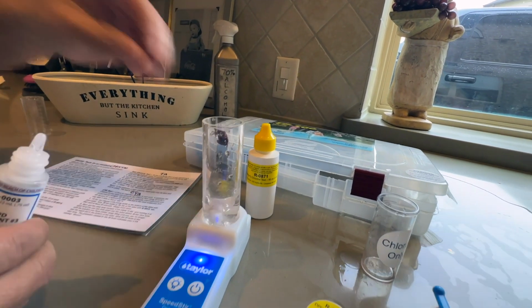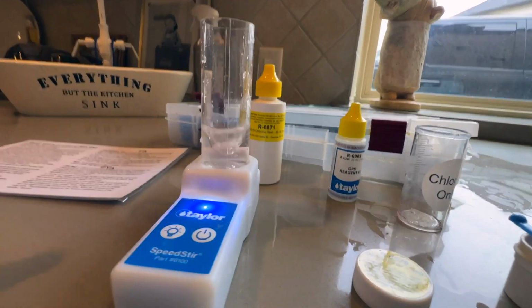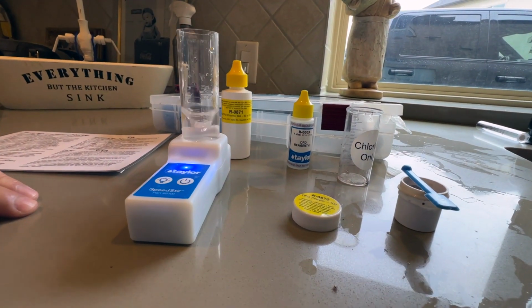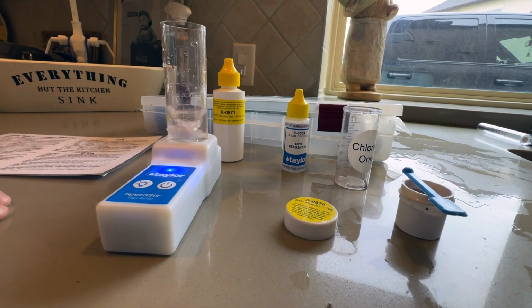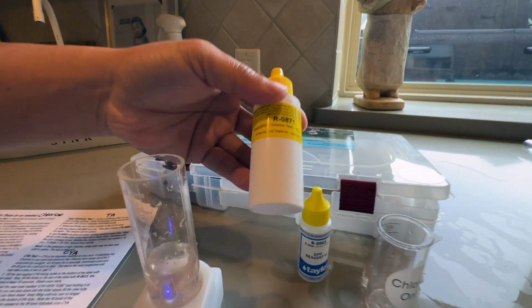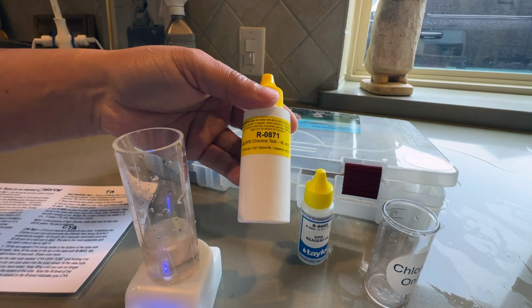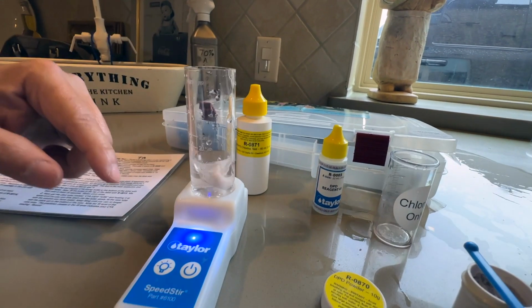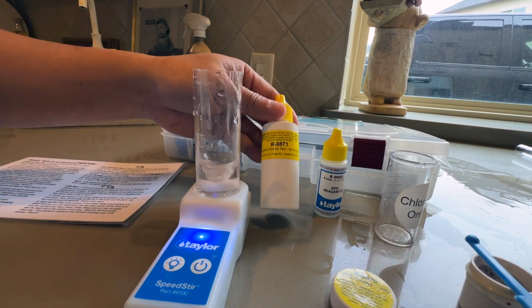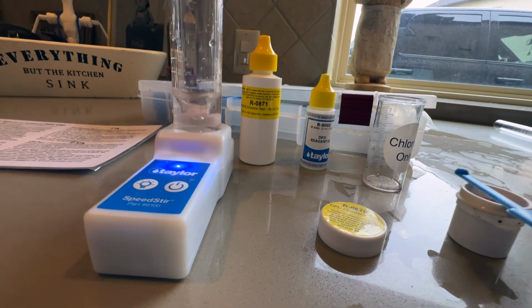All right. Now that should have turned pink if you have combined chlorine. Mine did not turn pink. That means I don't have any combined chlorine, so I don't really need to continue measuring it. If it did turn pink for you, then you repeat the same process. You drop however many drops you need of the R0871 until it's clear, and then you divide that by 2. Then you have your combined chlorine level using that second test.